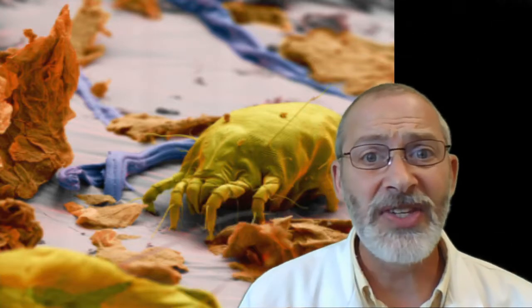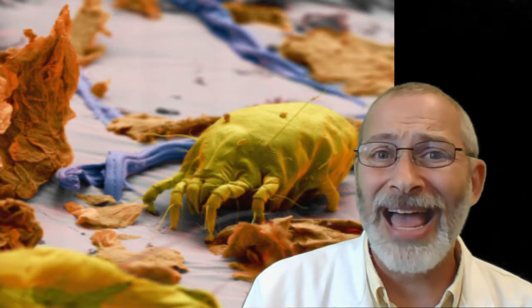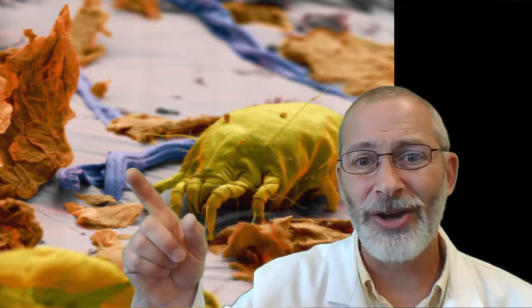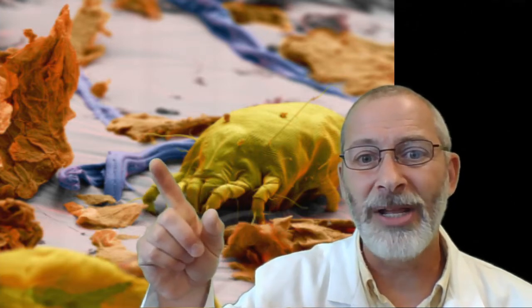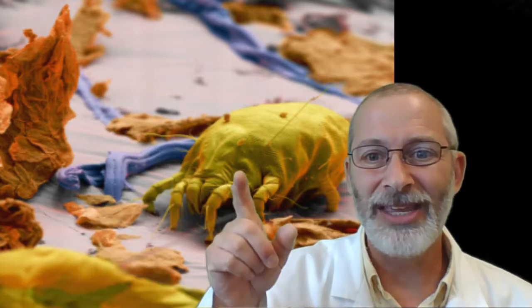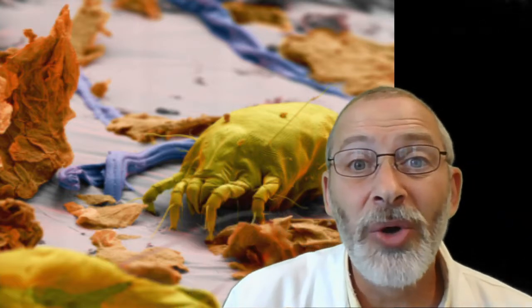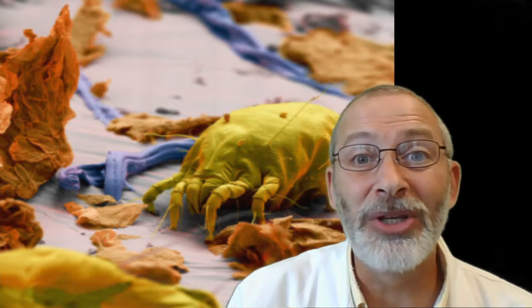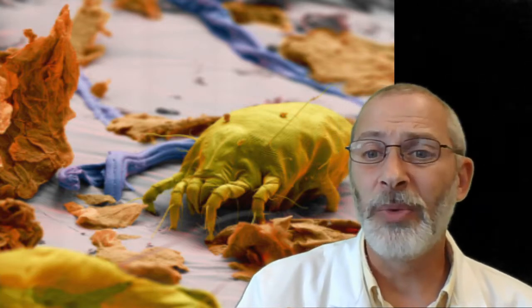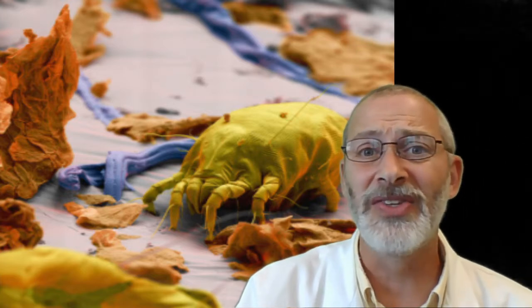All of the dead skin cells that you produce, you can thank these recyclers for chowing down on them and eating them up. And the different colors you see here actually are threads in a pillowcase. This brown stuff here, those are dead skin cells. And here is our skin mite. So if you ever feel alone, you're never really alone because we are surrounded by critters like these all the time. But again, we can be thankful for skin mites for cleaning up after we lose our millions of skin cells every day.